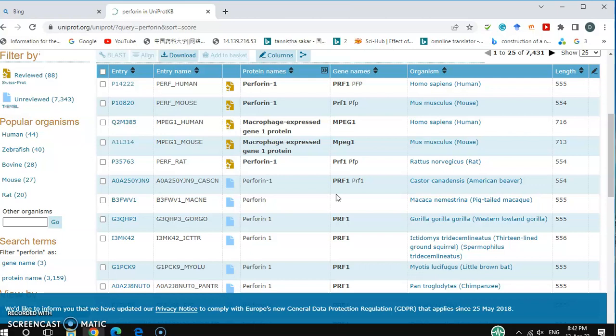The first: if you have a 3D structure of the protein and you might be missing some part of the protein that is very important for docking, in that case you have to make a new model. Because if part of the structure is missing from the entire protein structure, then it might influence your docking or other useful tools. So that is one reason.